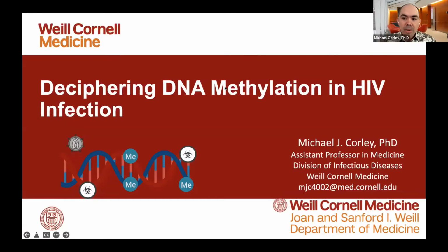So today, I wanted to give a brief overview of our lab's application of looking at DNA methylation states in the context of both HIV infection of the host, and also an application that we've recently adopted and tried with the Twist protocol to look at potentially provirus DNA methylation states.